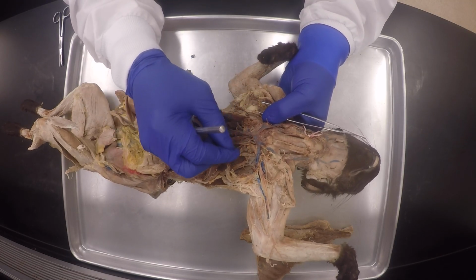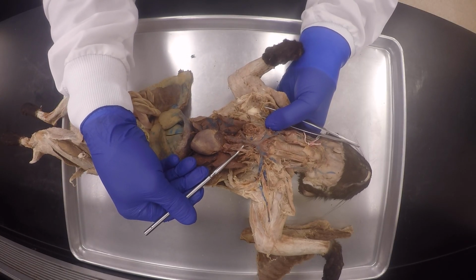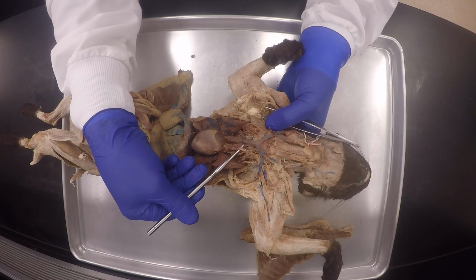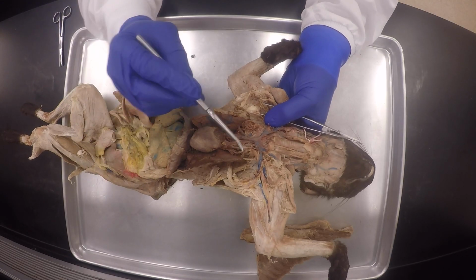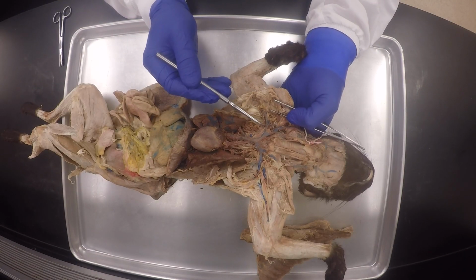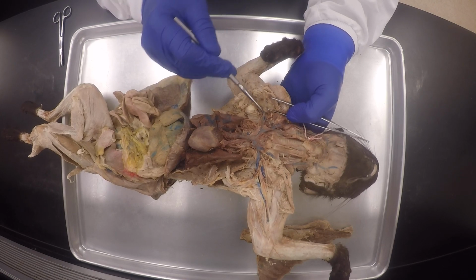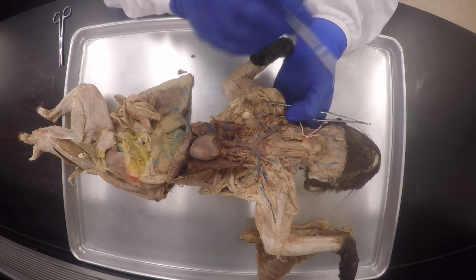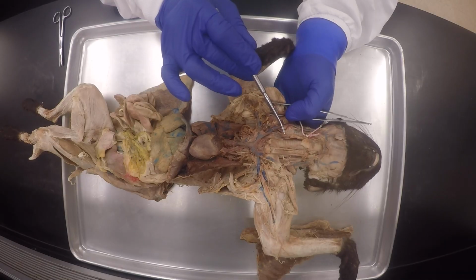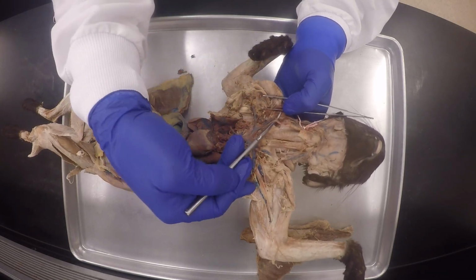You see there's a bit of red in this one, and it's coming from the left subclavian artery. Okay, so anyway, it's not very much infused, so I won't waste your time with that. But again, the cats that we have on the pictures are very good cats. I'll check tomorrow with the next one.